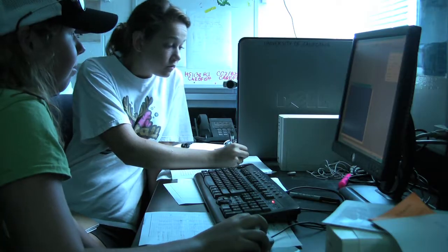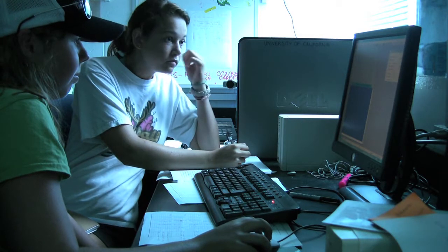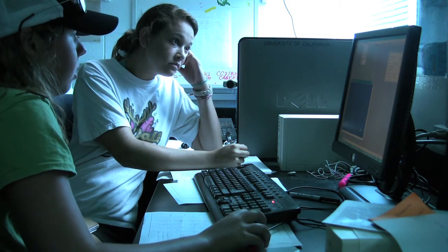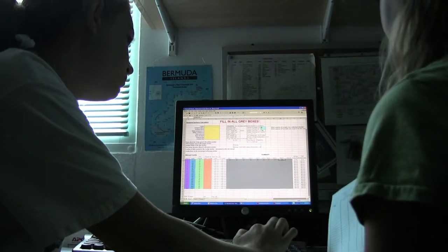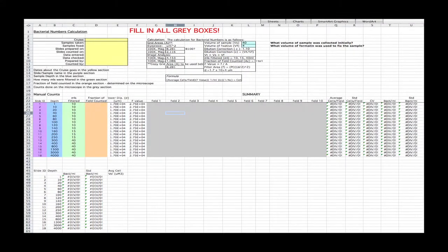Then we send the folder to the other computer to count them. You take the picture from the microscope, open it in the software, select the DAPI settings, and record how many blue dots you see. We do that 12 times, then exclude the highest and lowest counts, so we have 10 altogether. We put those 10 onto an Excel spreadsheet to analyze.